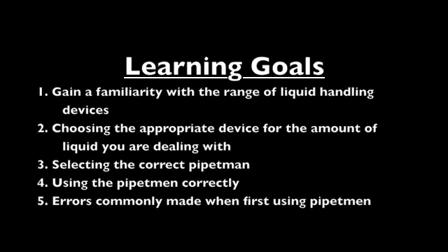This video is designed to give you an insight into the range of liquid handling devices available to you within the biochemistry teaching lab. Secondly, to help you choose the appropriate device for the amount of liquid you are dealing with. This video is especially concerned with selecting the correct pipetman for the volume you are pipetting and how to use the pipetman accurately. Finally, there is a section on errors commonly made when first learning to use the pipetman.